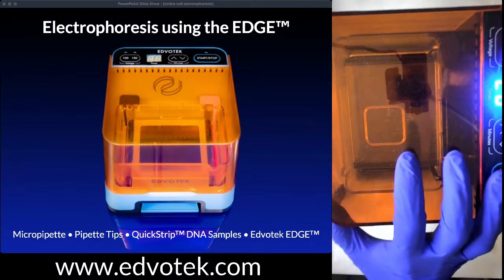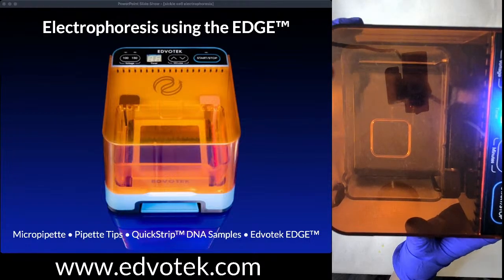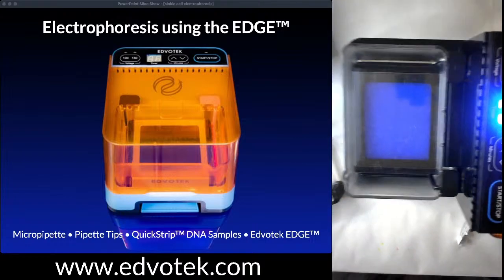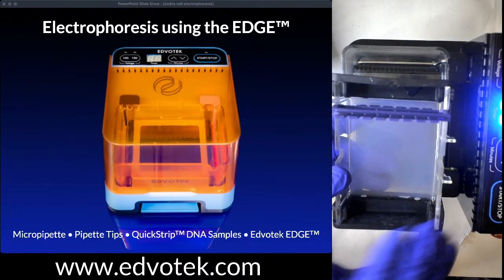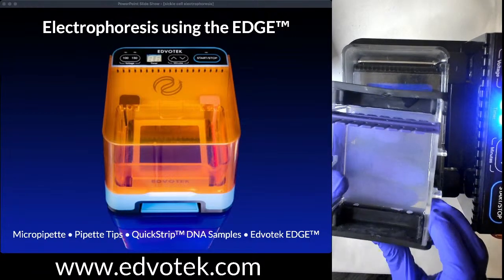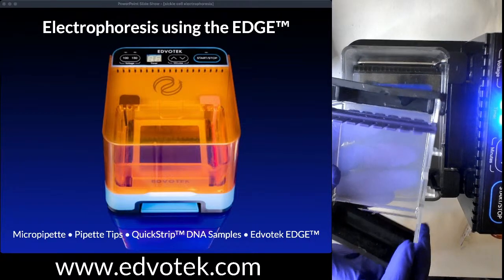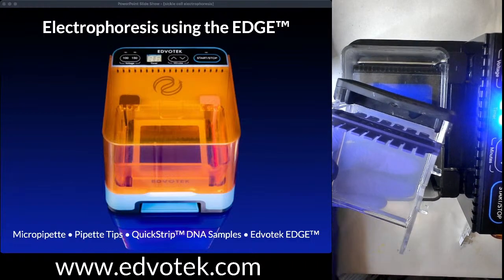And so we are doing agarose gel electrophoresis today. Agarose is our matrix for separation. I call it my science jello. And so this agarose, which I have cast in our casting system, is going to act like a strainer or molecular sieve, which is going to allow us to separate our different DNA molecules by size. And that's important for the results of our experiment.